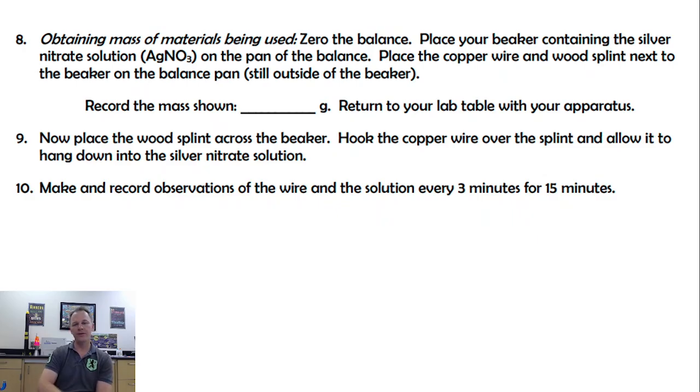All right, hopefully you weighed your stuff. I had an alarming number of people that got to the end of the lab and asked me, what does record the mass mean? And I said, it means weigh your stuff. You weighed your stuff before the experiment, right? And they said, no.